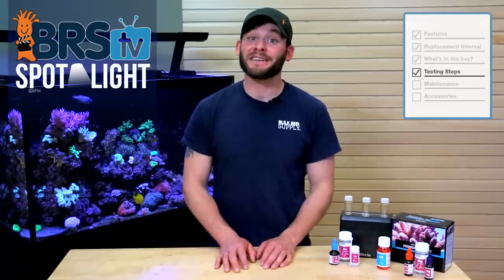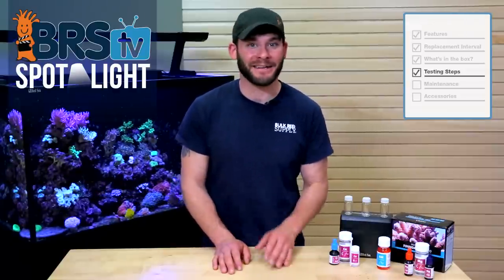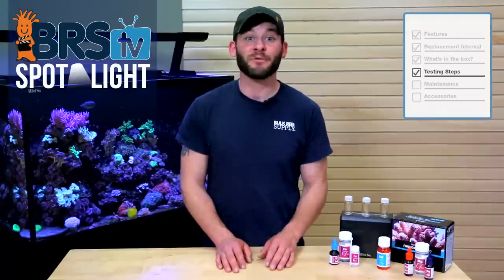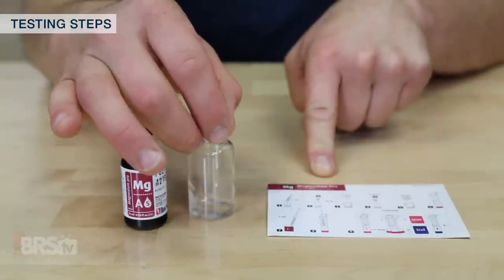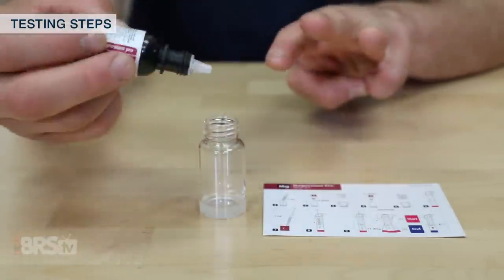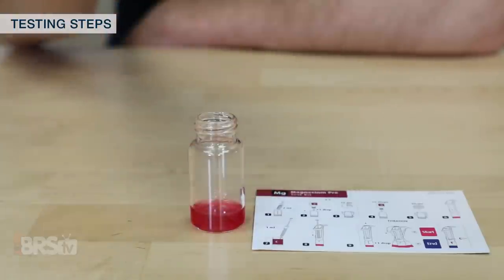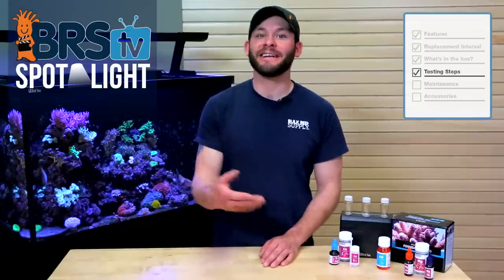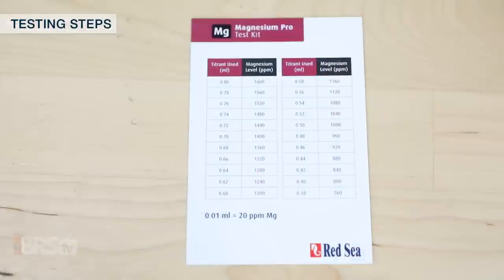Finally, the magnesium test has much of the same steps as the alkalinity and calcium, but requires a touch more attention to how the reagents A and B are added. For this test, I only need two milliliters of sample water, and I can start adding the required five drops of magnesium reagent A. Rather than add all five drops at once, I need to gently shake the vial for a full 15 seconds after each drop — I personally like to keep count with my other hand after each one. Then add five drops of the B magnesium component, shake for a few seconds, and let the sample sit for a full 60 seconds. When the time is up, follow the same titration procedure as with the alkalinity and calcium tests, watching for the sample to change from pink to a shade of blue near the end color on the testing card, then compare to the chart for your reading.